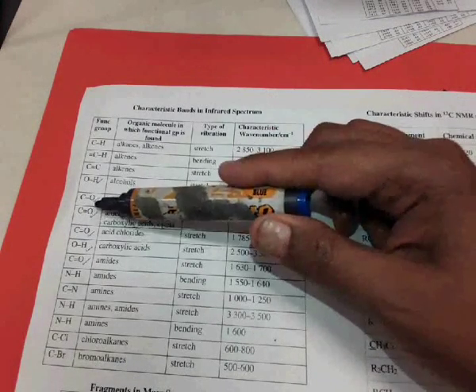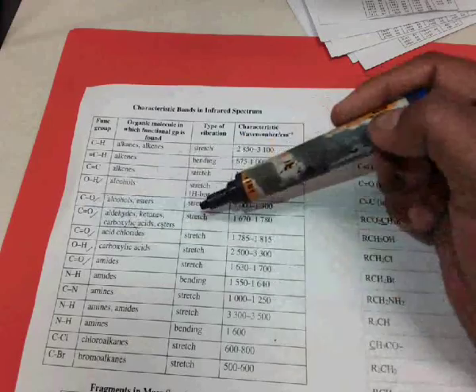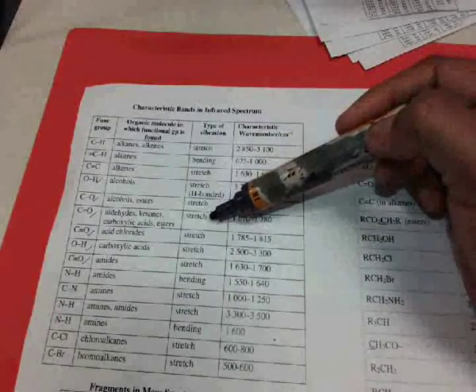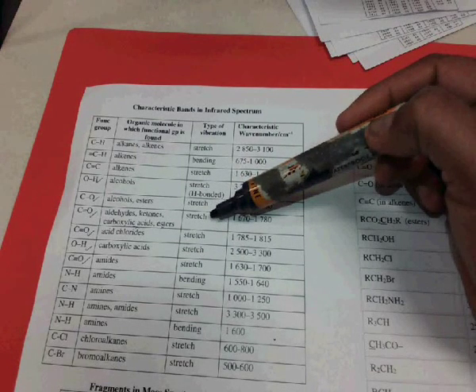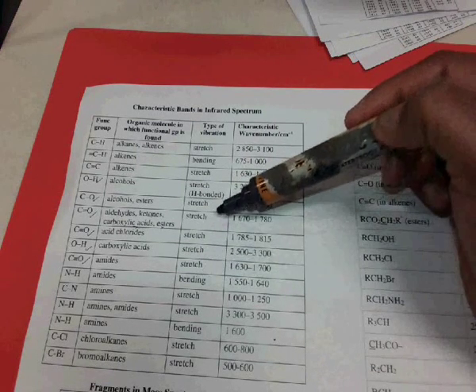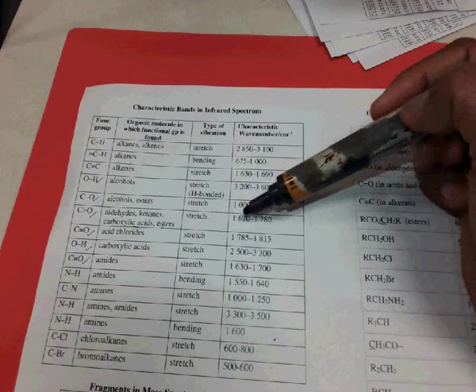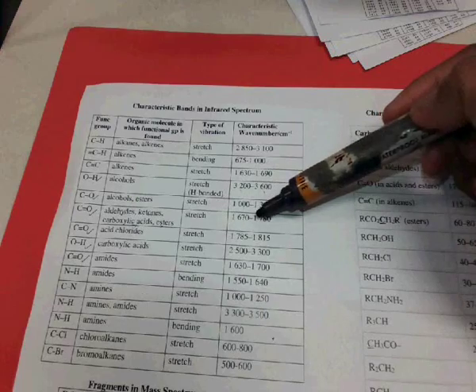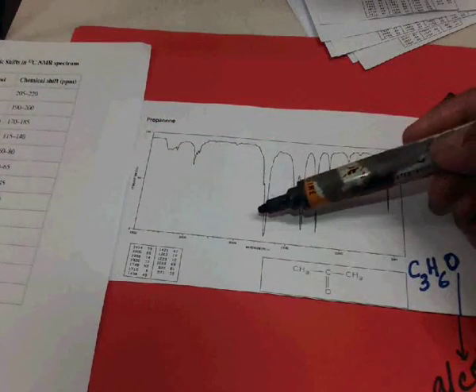So I'm looking for a C double bond O stretch. That carbonyl group, remember, has 2 vibrations, stretching or bending. This one at this particular wavelength is stretching, and it is between 1670 and 1780. So have a look and see if we do have some activity in that area.